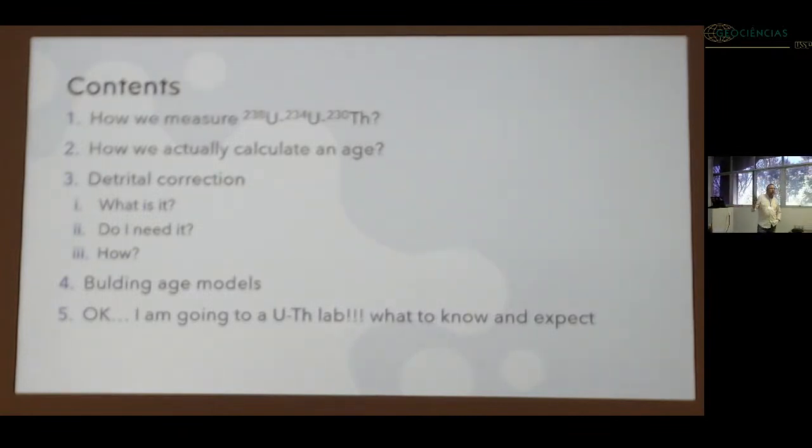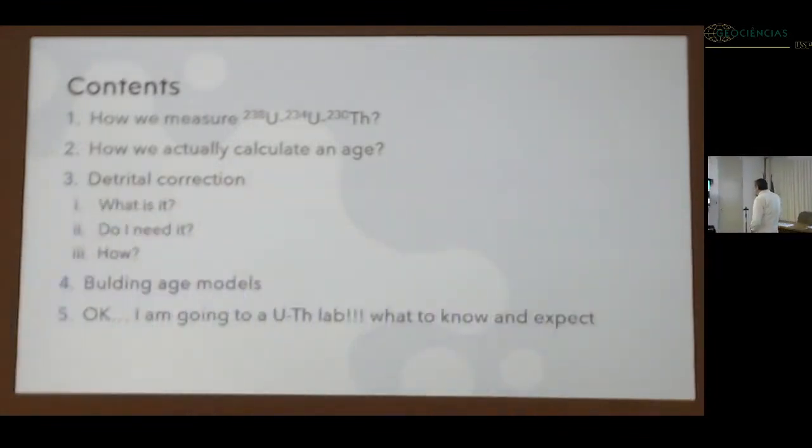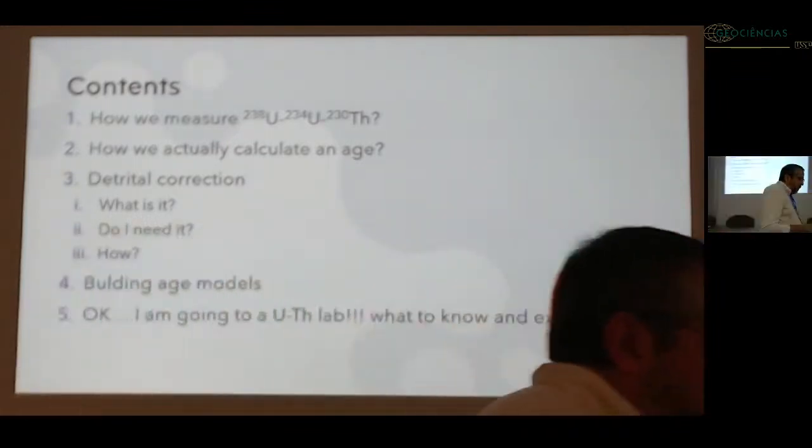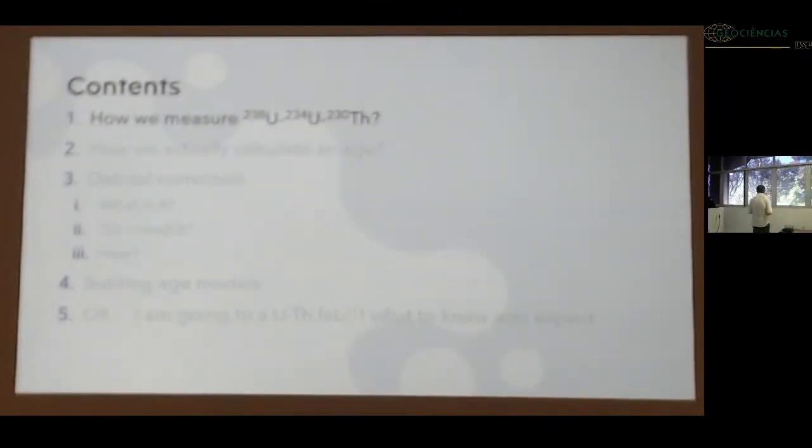A lot of this comes from what I've learned from 20 years of doing uranium thorium dating. Sometimes it's difficult to understand the papers because papers have to be very condensed, so I've tried to put it in an easier way to understand. So let's start with how we measure uranium isotopes and thorium.